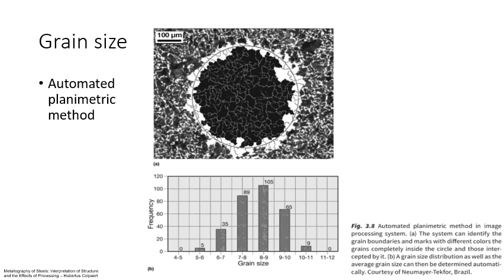Now some automated systems also use the planimetric method for grain size estimation, and they're very interesting, and at some point in this program it would be wonderful for us to prove out some of those systems as we understand the method, understand how it works, understand the potential pitfalls that can arise when this examination is performed using an automated system, and we prove out an automated system.